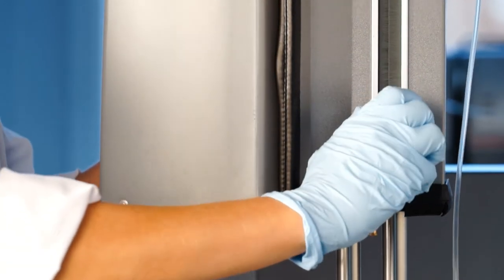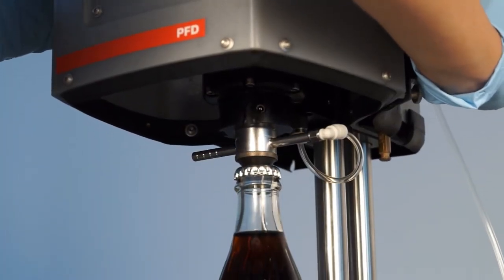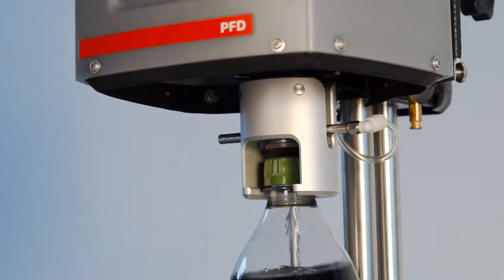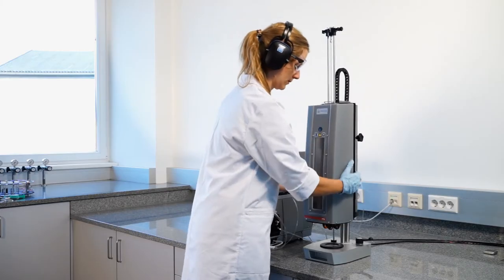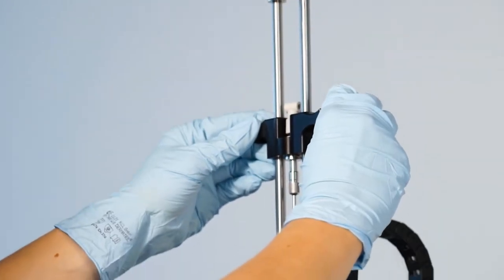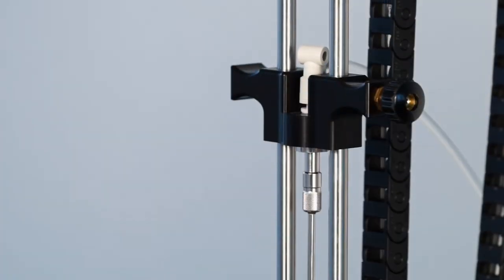For cans and glass bottles, adjust the height so that the ring disappears under the piercing head. For PET bottles, lift up the handle and just insert the bottle into the adapter. PET bottles need to hang in the piercing and filling device without touching the ground.